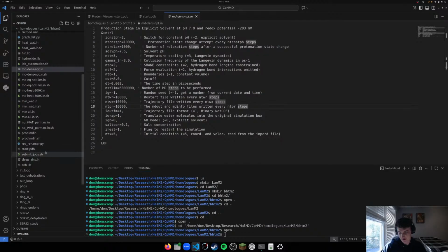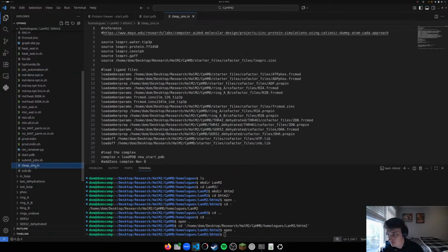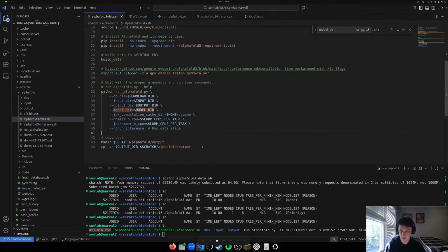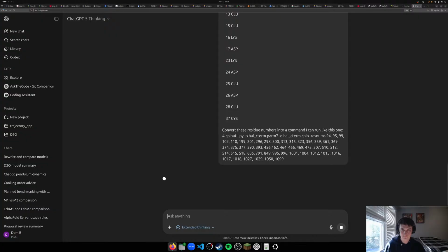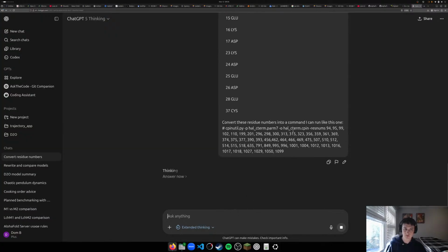One of the best use cases for AI is just getting rid of this mundane stuff. So there should be 50 here. Oh.